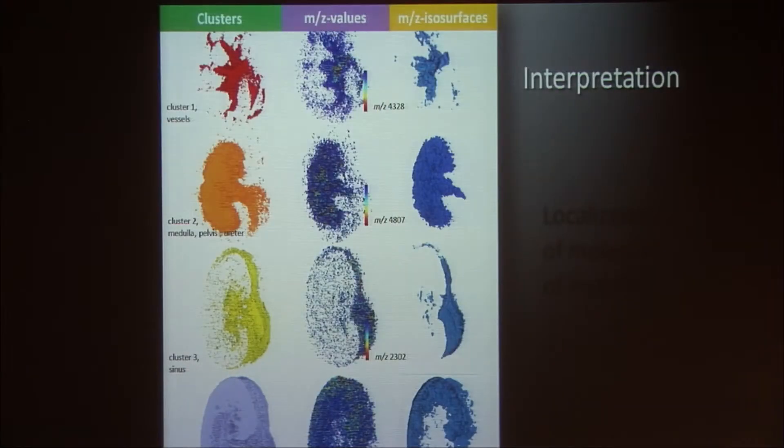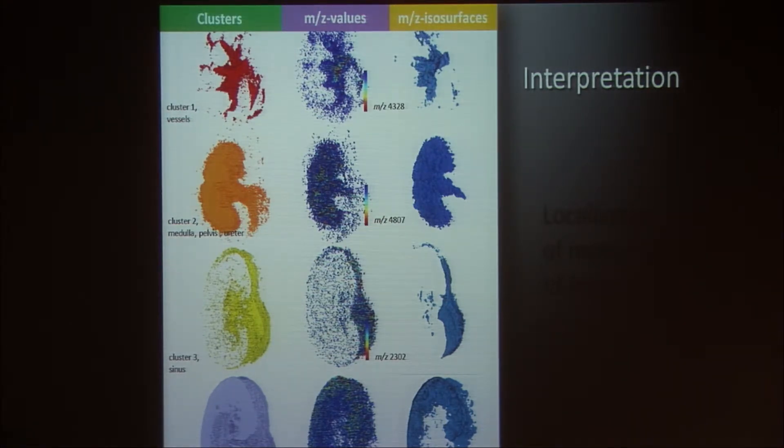We applied automatic image segmentation and were able to reconstruct this mouse kidney and its anatomical structures. When we overlay them with an MRI, we get a very nice overview of the anatomy of the kidney. Then we can come back to the molecules — which molecules are co-localized with which anatomical region. In this 200-gigabyte dataset we have information about thousands of molecules and their spatial localization.